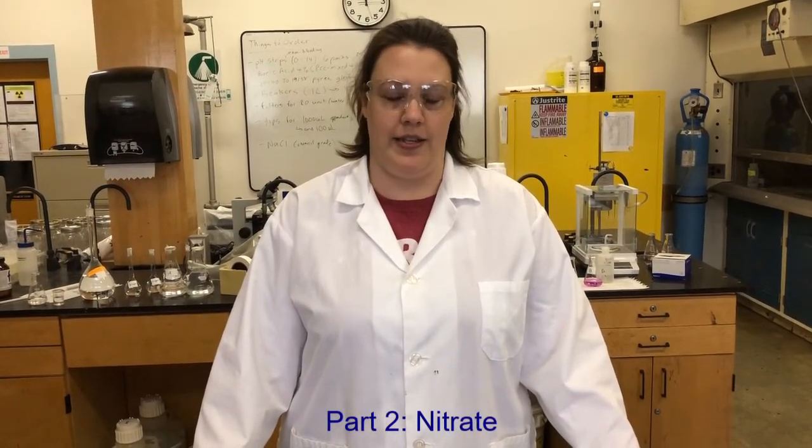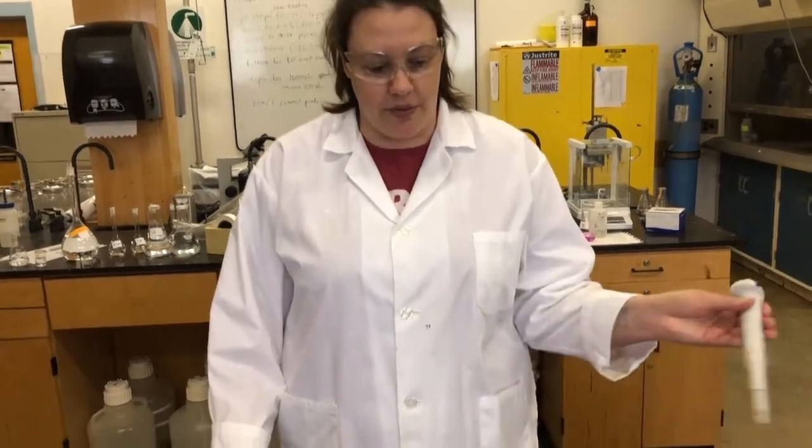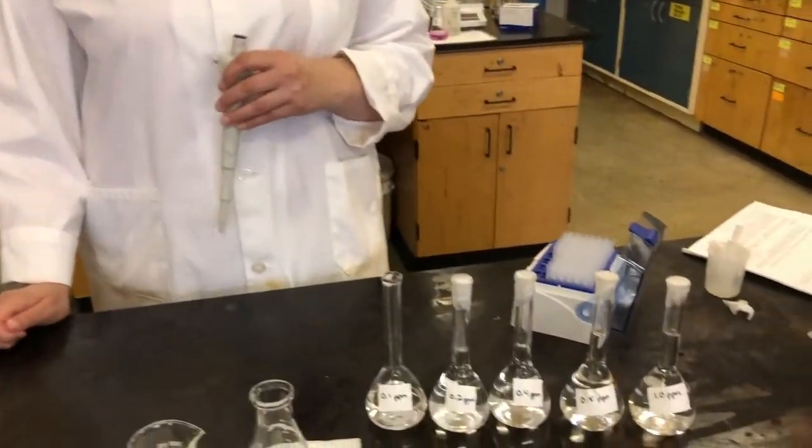Okay, so now we're going to look at determining the nitrate content. So this is a rapid technique that is used for screening samples for the presence of organic matter. So it's a fairly simple technique. All we have to do is acidify the sample with hydrochloric acid, and then we can measure it on our spectrophotometer at 220 nanometers. Okay, so we're going to start with our standards again, like we did for the nitrites.